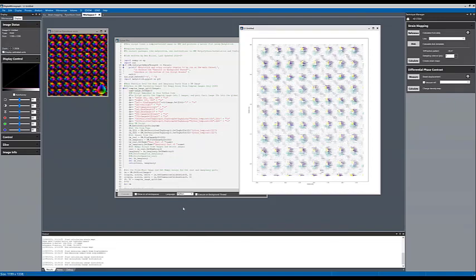So we have some basic tools for data processing that are quick and easy to use. And if you need to do more with your data, as you will see, Stephanie and Roberto are going to show you later today, you can also do that via scripting in Digital Micrograph.